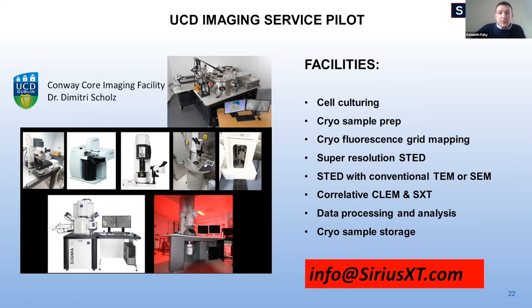We're currently submitting a Euro-Bioimaging report based on users to date, so the timeline of the UCD commissioning should hopefully coincide nicely with this application. Several potential workflows are available at Conway, such as, in addition to soft X-ray tomography, correlation of super resolution STED with conventional TEM or SEM, as well as ongoing work to integrate soft X-ray tomography into this workflow in the coming months.